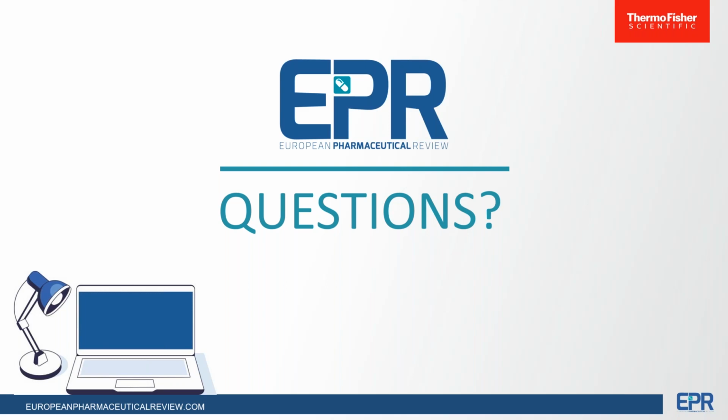Thank you for the question. The question can be answered as long as you can prove within the calibration and validation studies, first of all, the specificity, that the solvent that you want to measure, you can see within a near infrared, Raman or infrared spectrum. And the second criteria would be, of course, whether you can get to the levels desired as per the HPLC or Karl Fischer titration that you want to use. So of course you can.